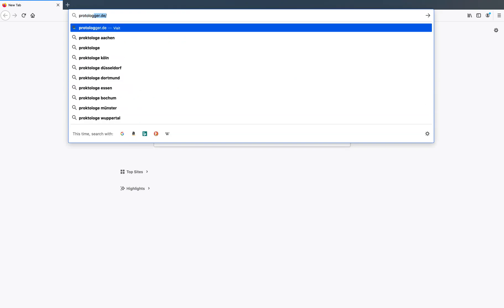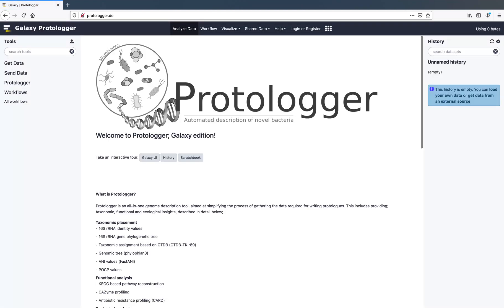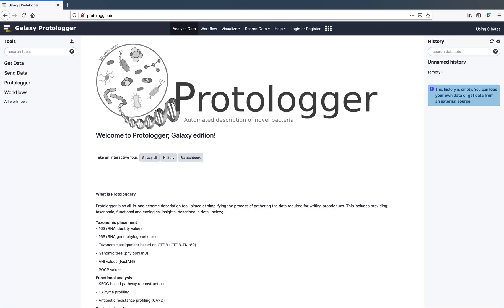Protologger can be accessed at protologger.de. We recommend registering an account before submitting your isolate for analysis, allowing you to save your work. Each user is provided one gigabyte of space, enough for a minimum of 20 analysis runs.